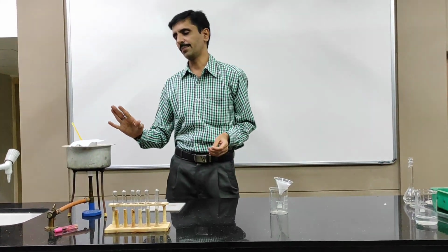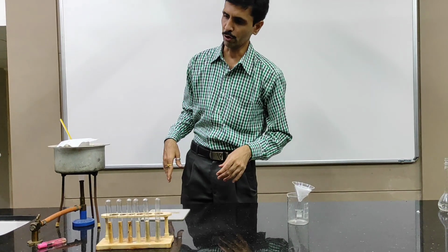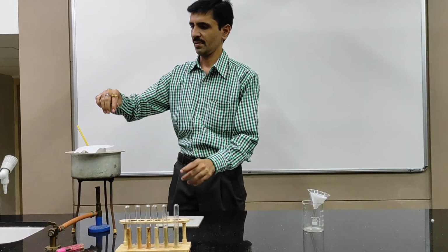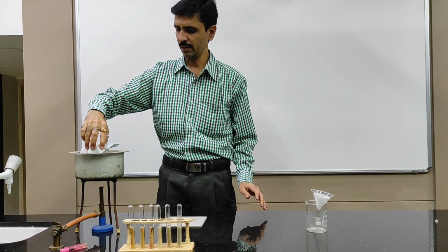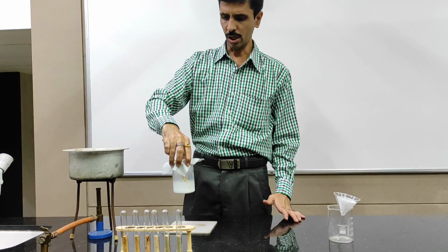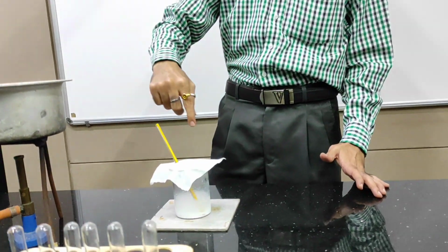Right, so as far as the digestion part is concerned, it's done. So we are going to put off the burner. Now, very slowly, we are going to put this hot beaker onto an asbestos sheet. Now you can check it out over here.